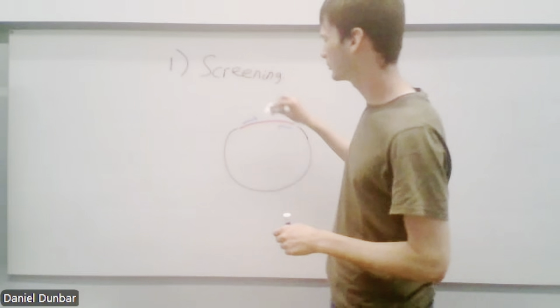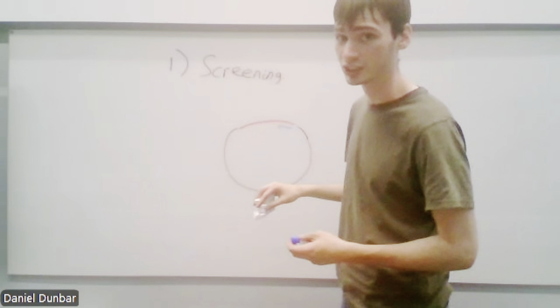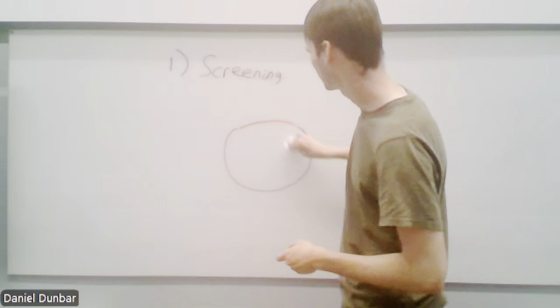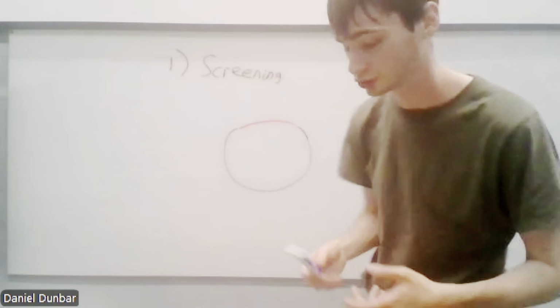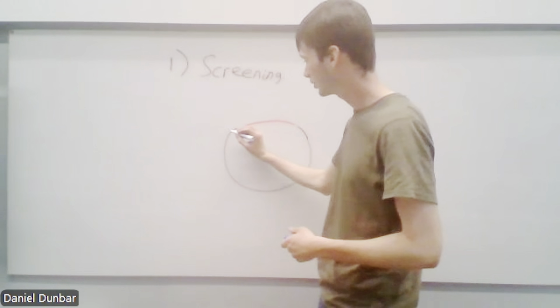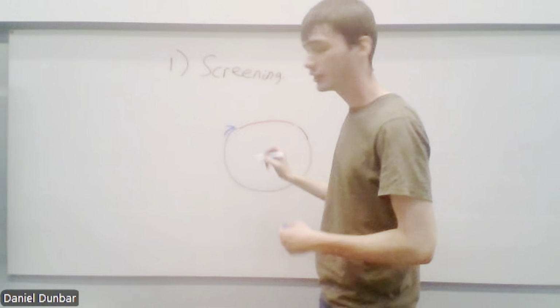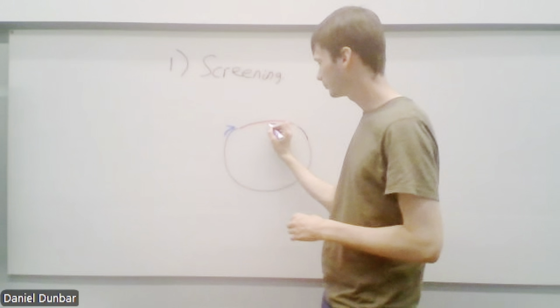And then there's a third way. And this way is particularly important with restriction digest and ligation, because that can produce wrong orientations, which is where you place one primer outside of the insert and one inside.